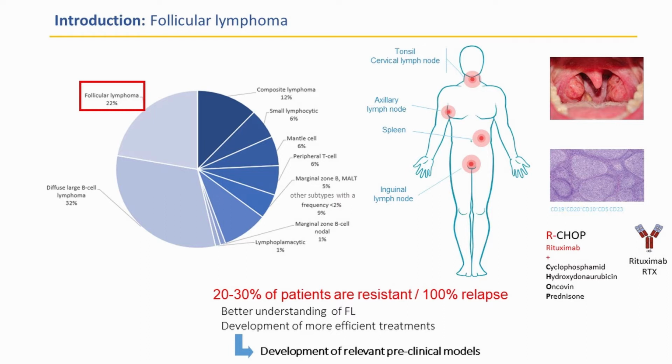To this end, the development of relevant in vitro models is crucial for testing new drugs in preclinical settings. Here, we present a simple workflow to generate patient-derived lymphoma spheroid established from dissociated FL biopsies adapted for high-throughput imaging and drug screening. This work is not yet published, so we are keeping confidential some key points about the methods.